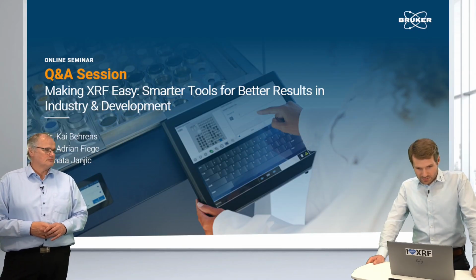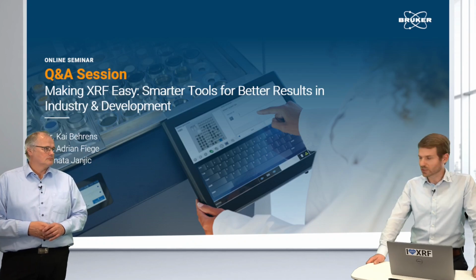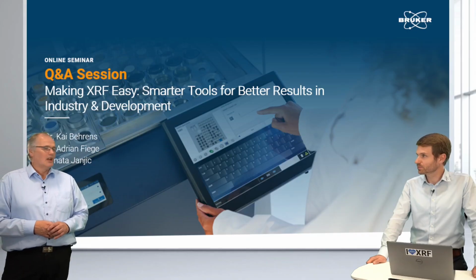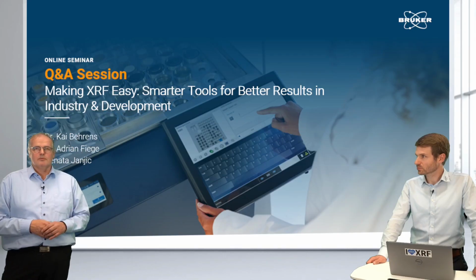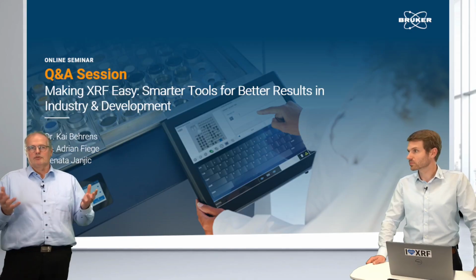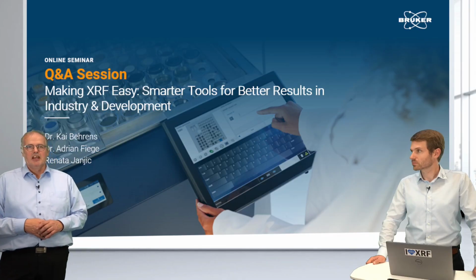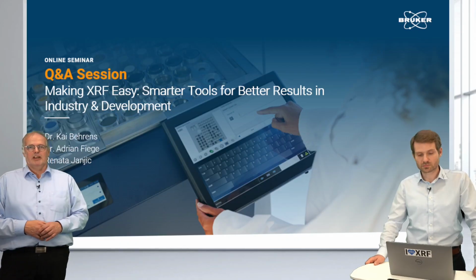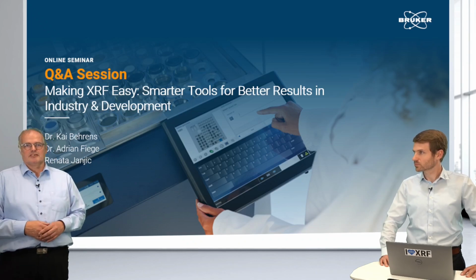Third question here is, we are analyzing various metals. Is it possible to run some test samples on your new device here? Yeah, it means we have instruments available across the globe in our hubs. So this could be Singapore, Bangalore, Europe, Paris, Karlsruhe, but also Madison or Atibaia in Brazil, Melbourne. So simply contact us and our local sales will help you and provide you data with our application scientists. And then you can go from that for the evaluation of future instruments.